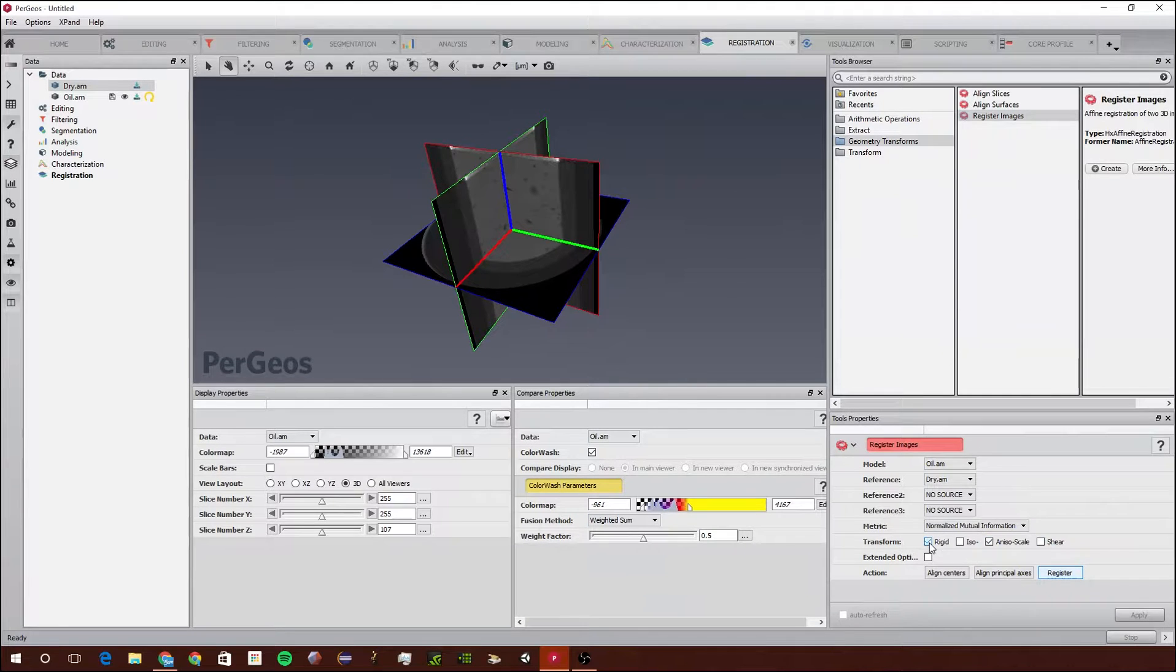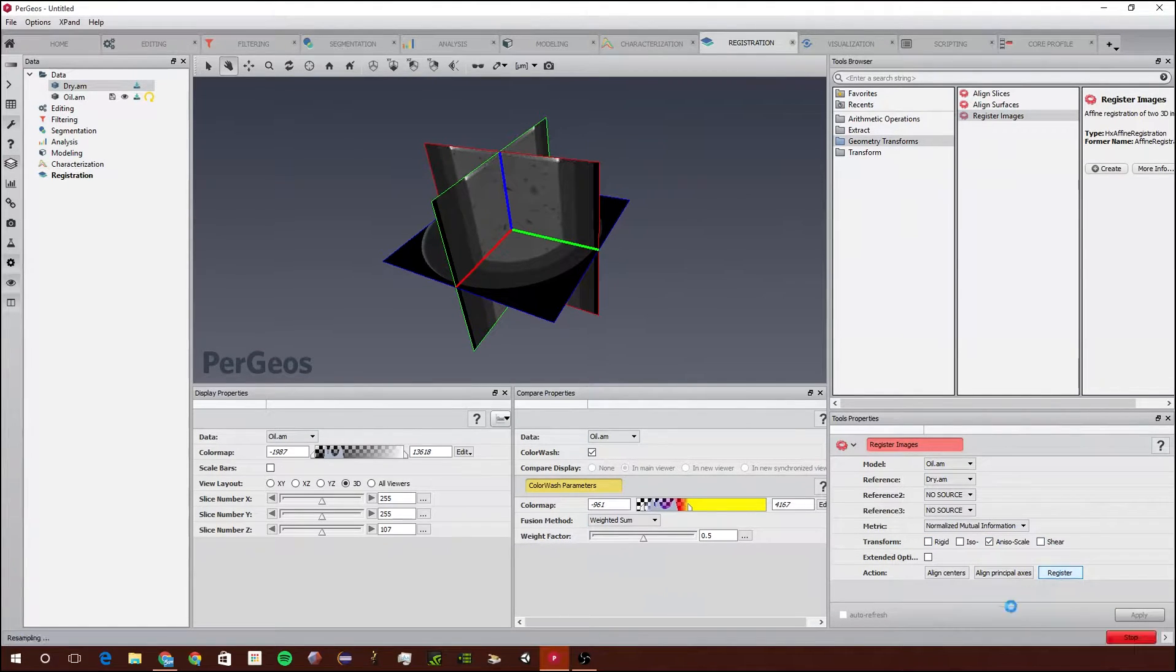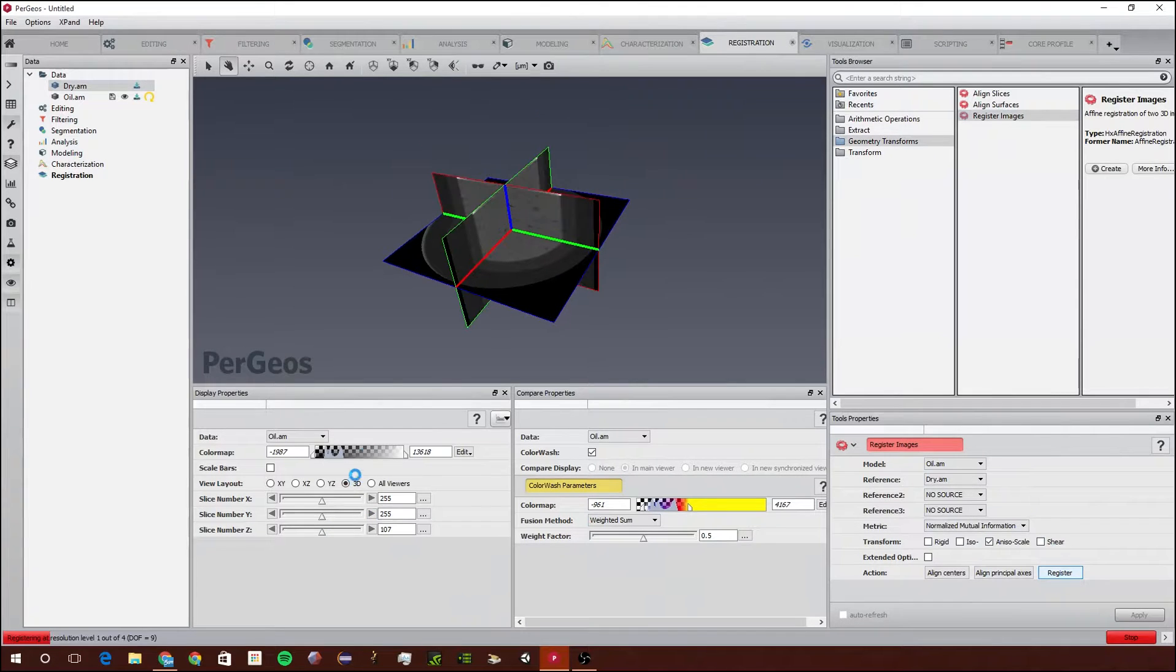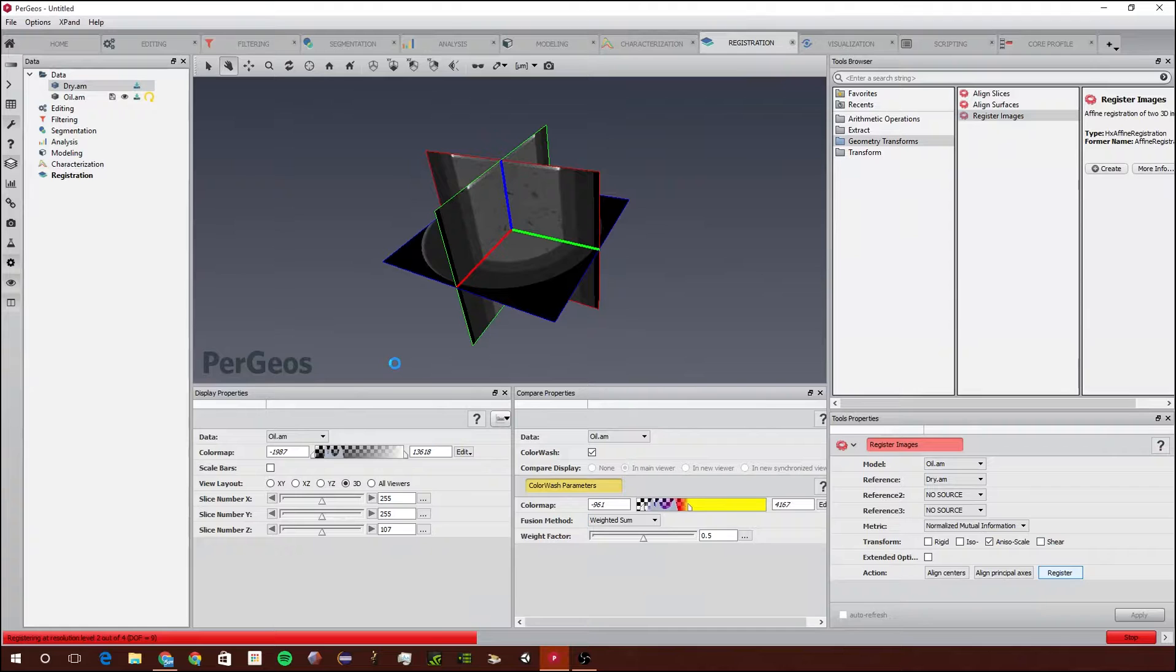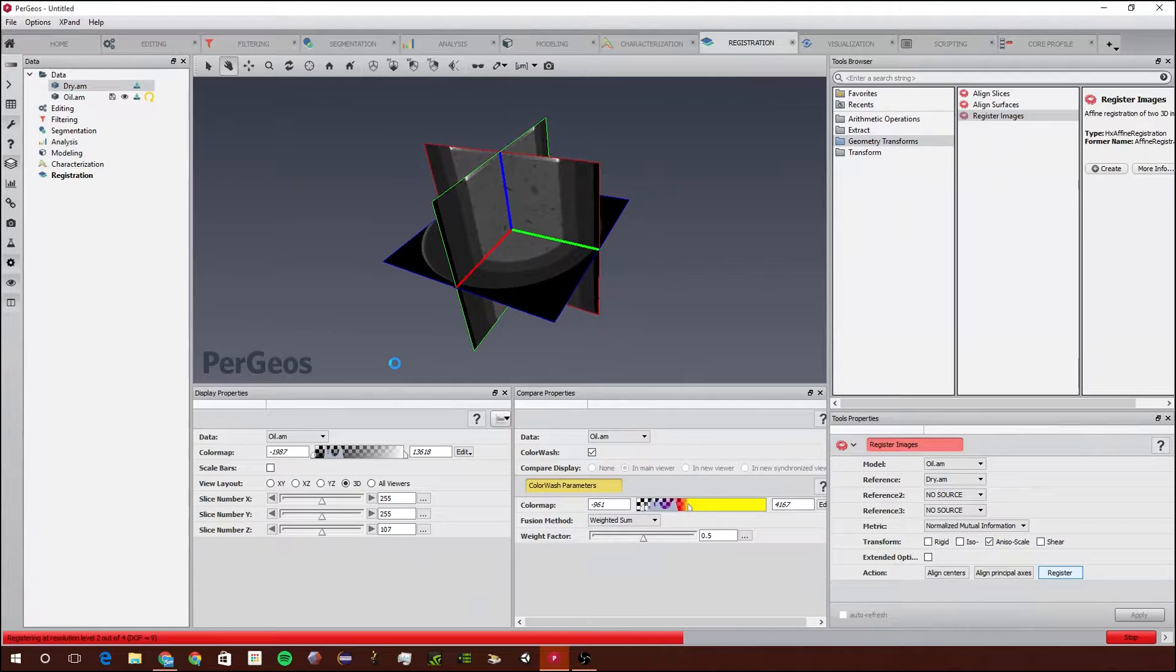Let's say I wanted to just try Anso Scale, so I'm going to try that and show you what happens. As you can see, it now scales instead of doing just rigid.